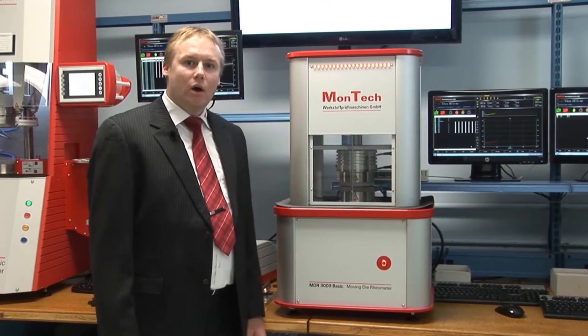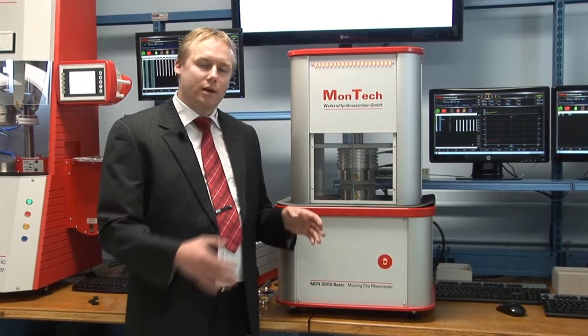You can also add a lot of automation options, starting from 5 sample automation to 10 sample automation, or 24-48 sample tray automation systems up to 480 sample tray changer automation systems, to improve efficiency and reduce labor and testing costs — regarding your rubber compound quality control or R&D testing.